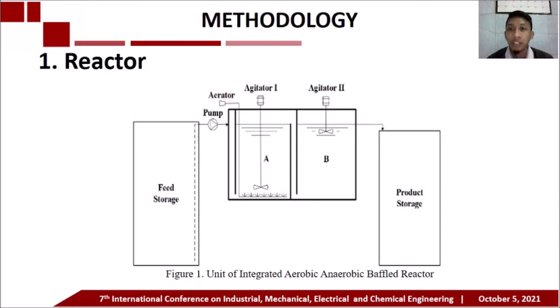The methodology: first is the reactor. This is the reactor of our study. It was made from glass board and had a working volume of 10 liters.